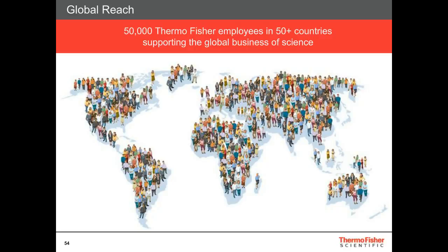What categories of substances interfere with accurate analyses with this equipment and methods? I think it can be more types of substances, for instance, some pigments in leek especially, or some acids, because we are using QuEChERS for sample preparation, and this method is very fast and easy to use, but as we don't use cleanup, the final extract is not so clean, so there can be some interferences. But thanks to using triple quadrupole or high resolution mass spectrometer for determination, they should not interfere. There should not be big problems with interferences.